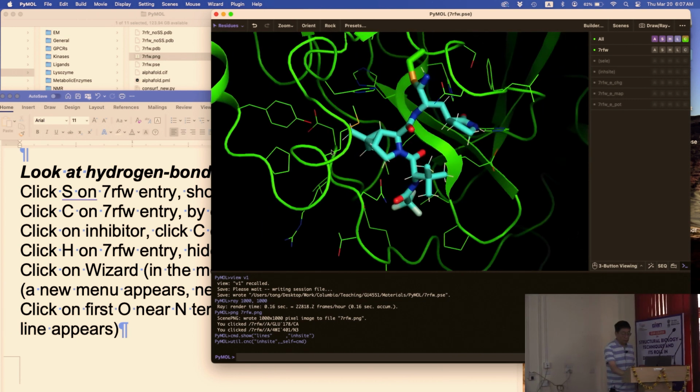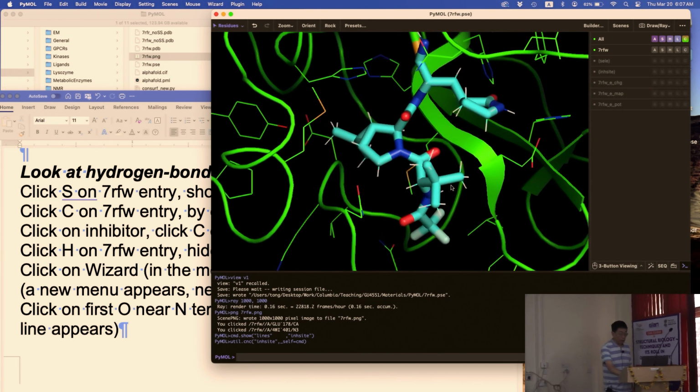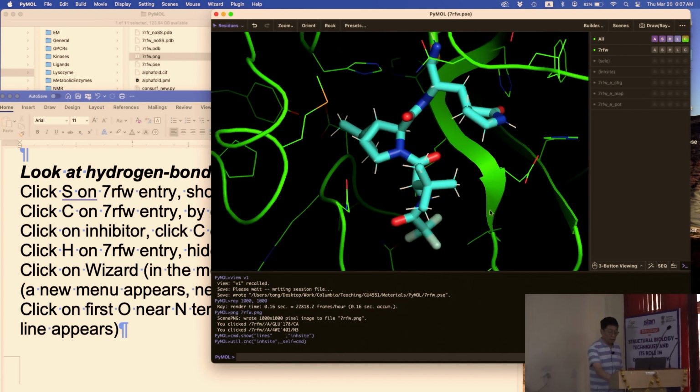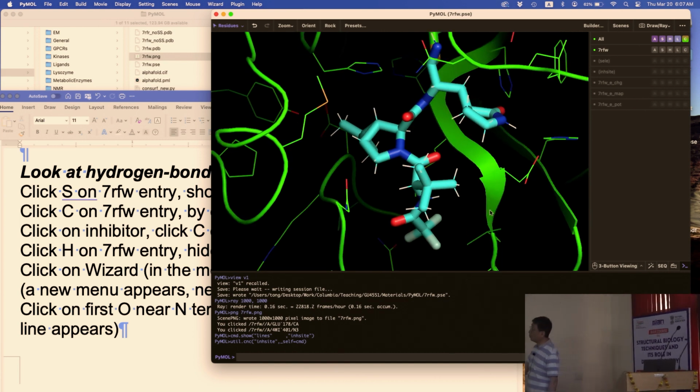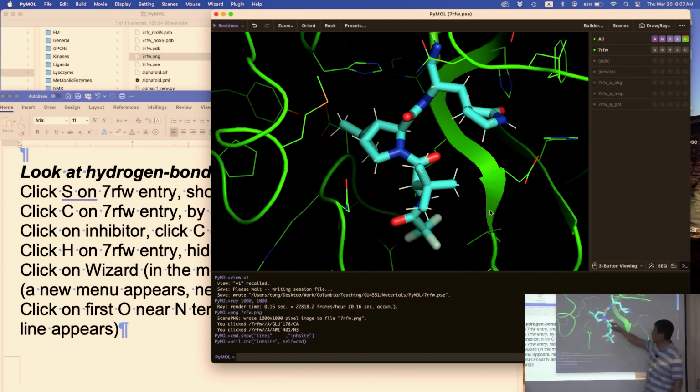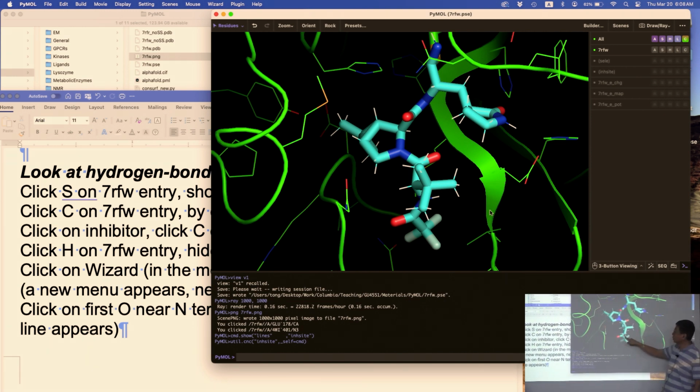So now let's zoom in some more. So something like that. Now with the compound going up, okay, so this is CON. So this is the N terminus, that's the C terminus. We'll make it going straight up in this view. Do you have it?